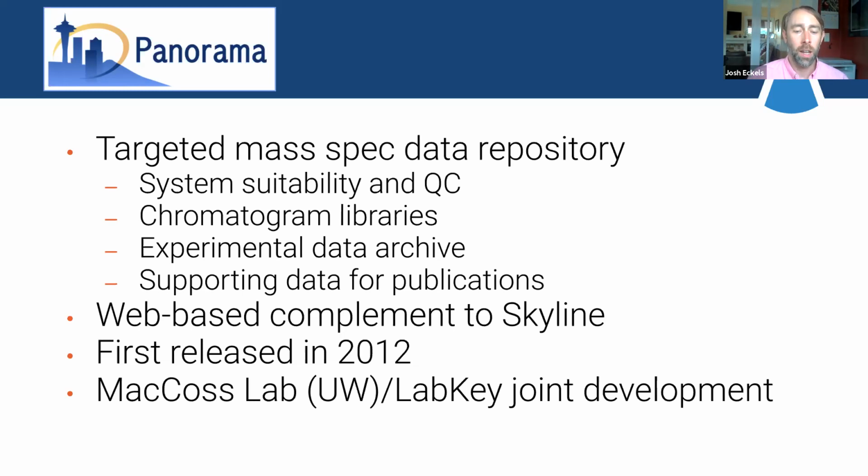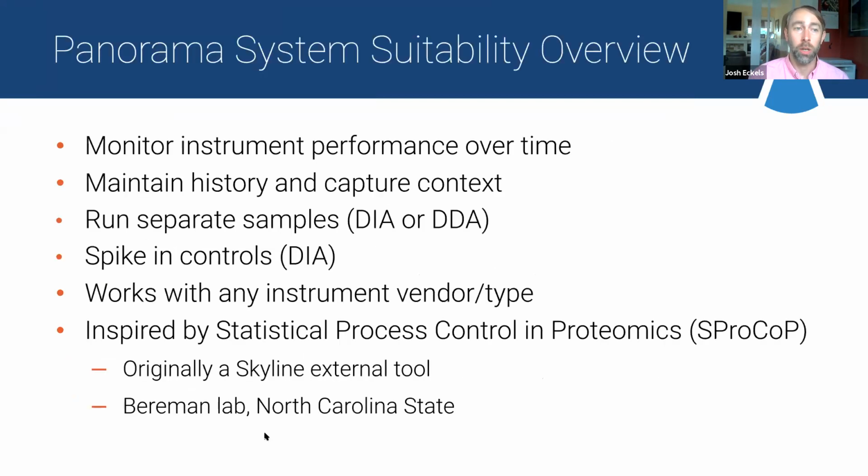I hope today you'll leave with some follow-up steps where you can say, great, for system suitability, now I know about this new tool suite, and I can pretty quickly and easily jump into that to reduce some of that drudgery from everyday life in the lab.